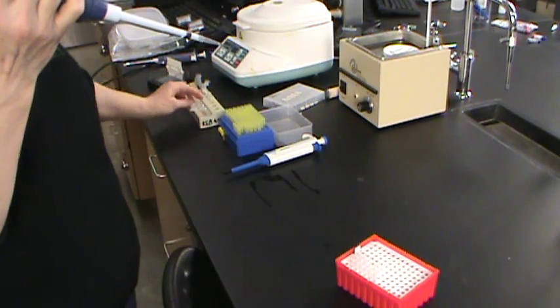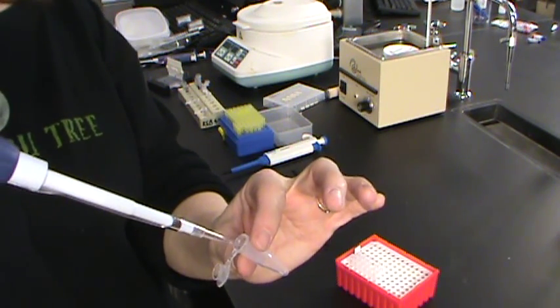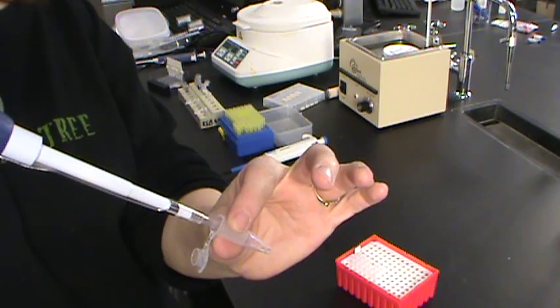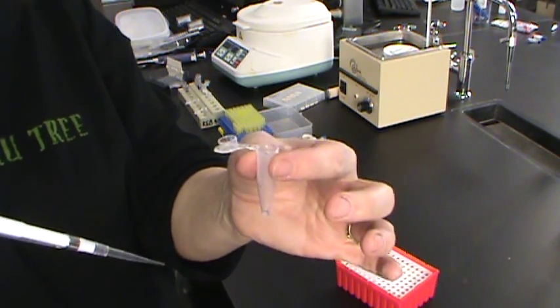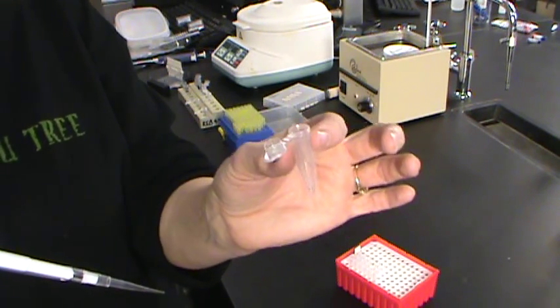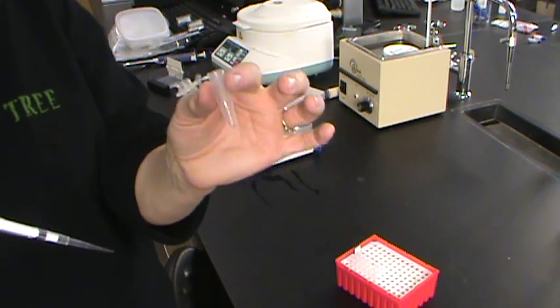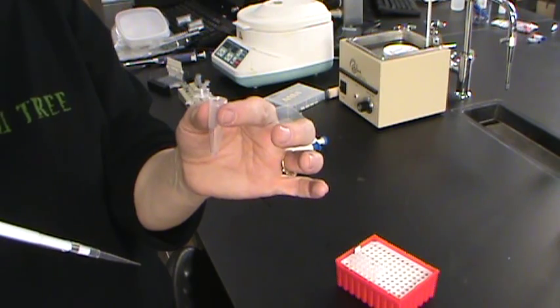You should see liquid in the pipette tip. Now to dispense, however, we're going to put our pipette tip in our microfuge tube, and we will not only go to the first stop, but the second stop. And that should accurately measure our volumes into our microfuge tubes. This shows another thing that we're going to use this week. Our chemistry is going to be done in these microfuge tubes, so we won't have to clean test tubes this week. These are disposable.